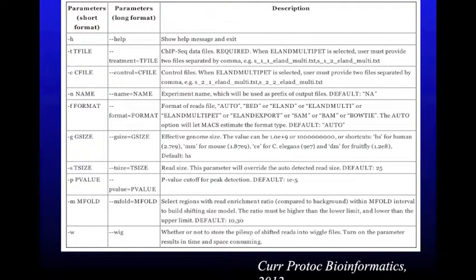So this is a table that summarizes some important parameters you could use while calling MACS. So you could refer to this if you have specific questions of your own.